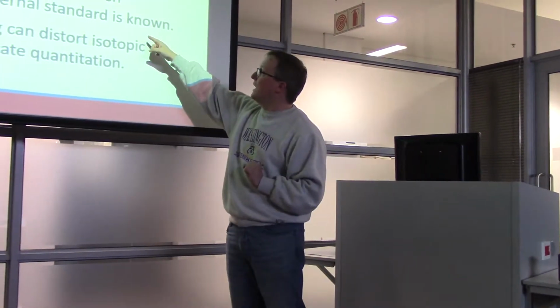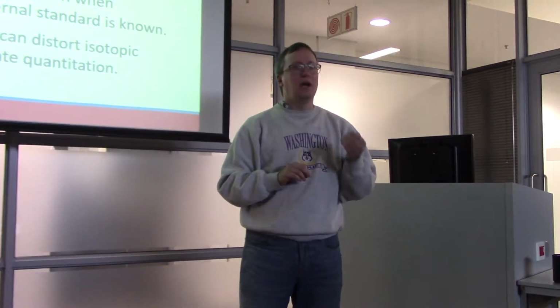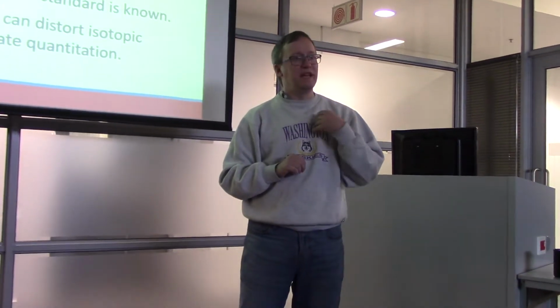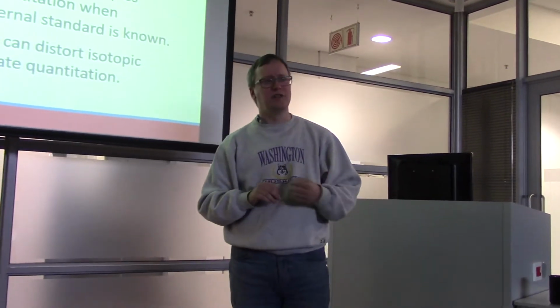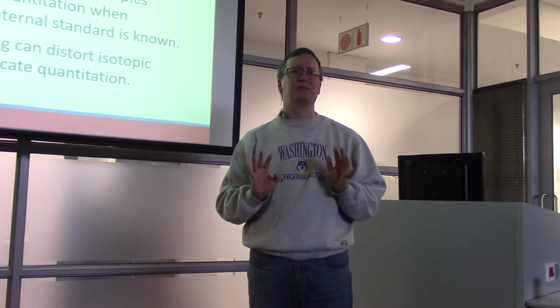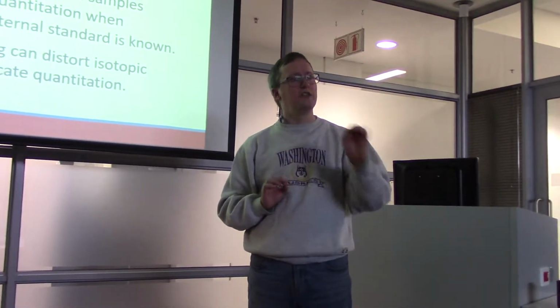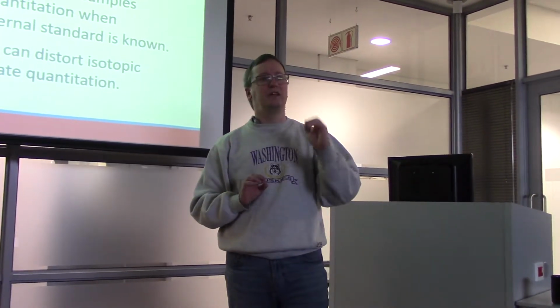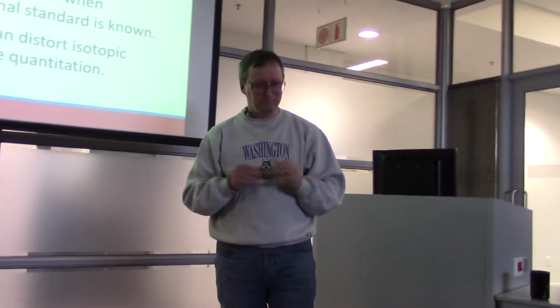All right. When you are using a labeled standard, you are able to make statements about the quantitation of a particular protein. You will frequently find proteomics people saying, we have absolute quantitation values on this particular protein because we know exactly how much labeled version we put in there.